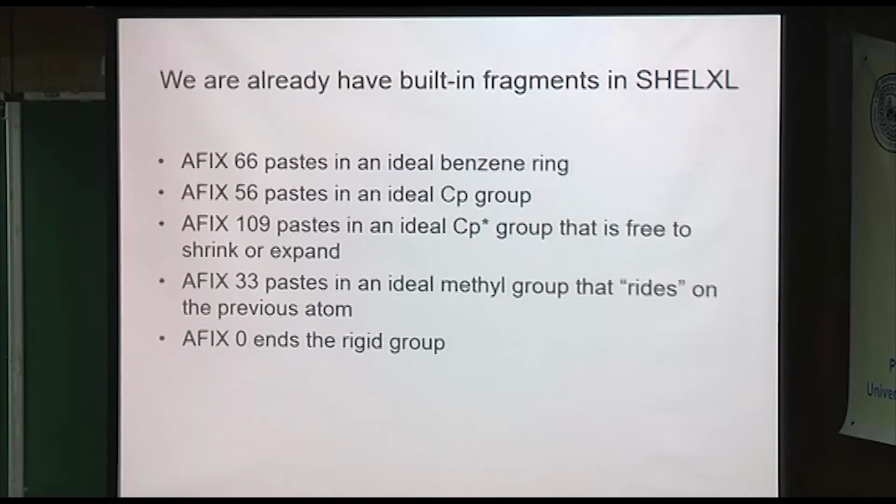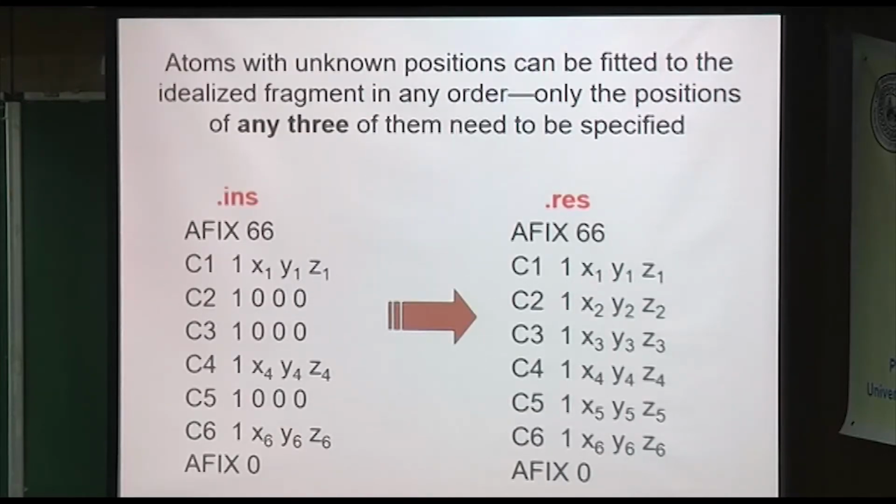So what do you need to do? Essentially, you only need to have 3 atoms, but they should not be coplanar. 3 atoms that are not coplanar to define the initial orientation. And then after that, everything follows, you'll see. Okay, so let's look at the benzene case. You have a benzene, and you can clearly see, you think, 3 atoms that you feel confident about.